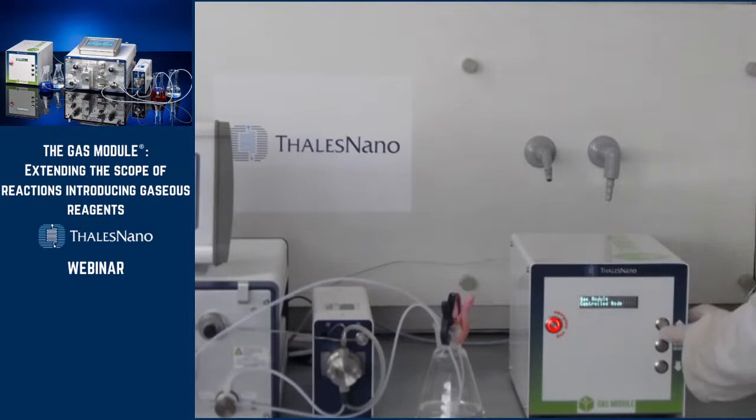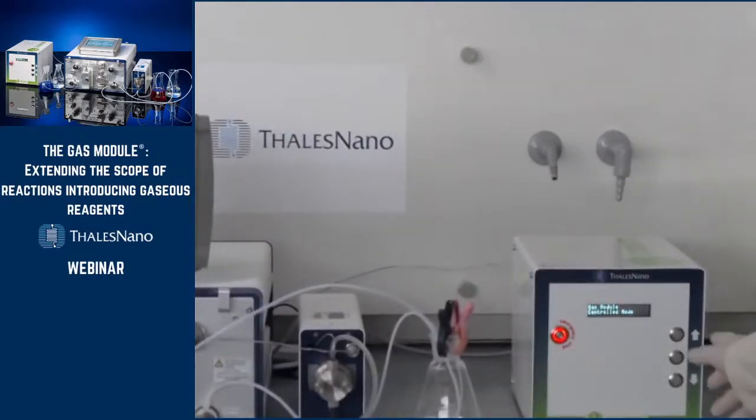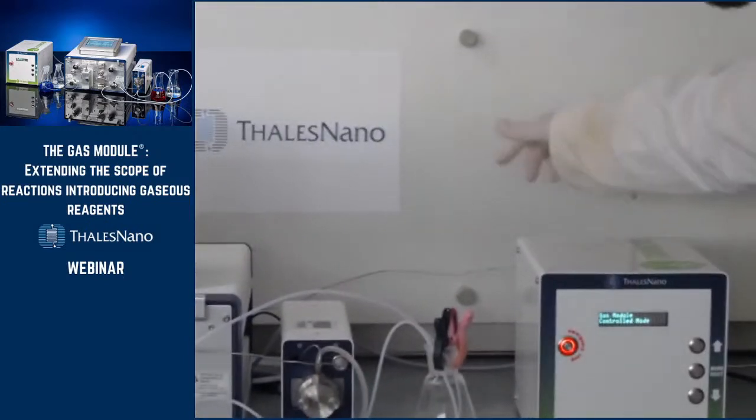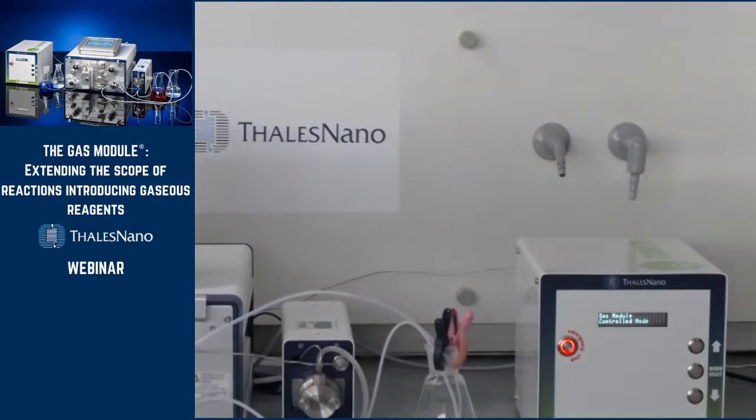But right now, if I'm pushing them, it does nothing, but you can see on the little screen, I hope, this is the control mode. That means it's connected to the H-Cube Pro because I connected it with a CAN cable that is passing behind. And this cable allows it to be controlled only from the interface of the H-Cube Pro.